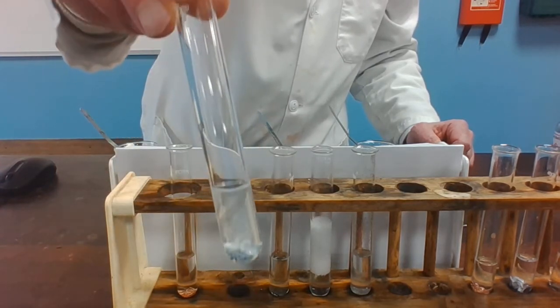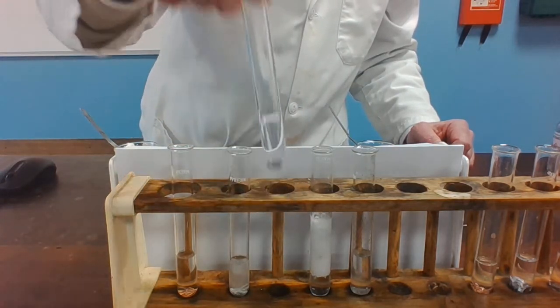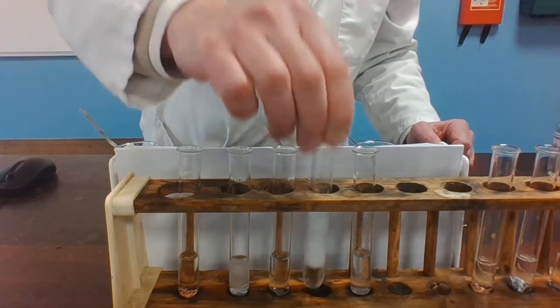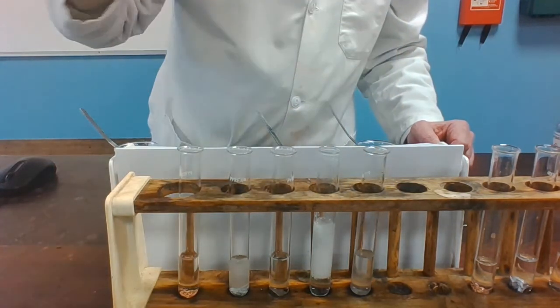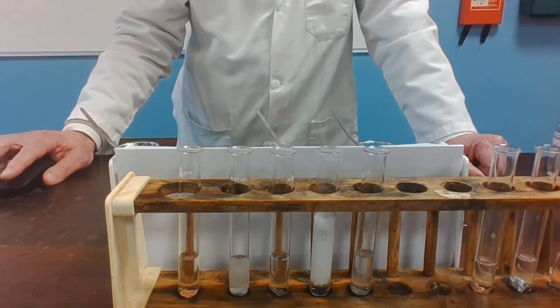Zinc. Lead. Magnesium. And iron. Have a look at the reactions and write down in the table what you can see.